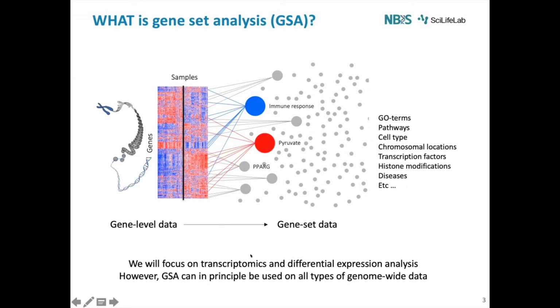But here we'll focus mostly on the transcriptomics and differential gene expression analysis that we have done in the course. But actually you can apply this to any kind of genomic data: DNA methylation, acetylation, ATAC-seq, chromatin accessibility, and so on.